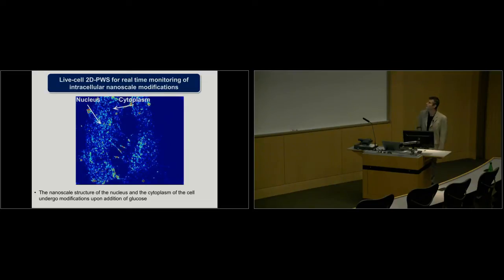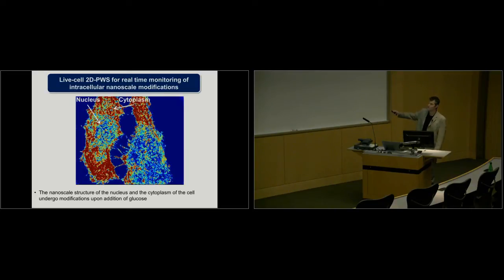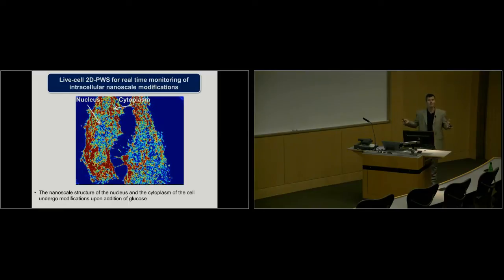Okay, right, boom. You see this wave propagation. The structure of the cytoplasm changed, the structure of the nucleus changed significantly. We don't really know what actually happens, because this process has never been observed before. But for the first time, using this technology, we can start asking questions of this kind.